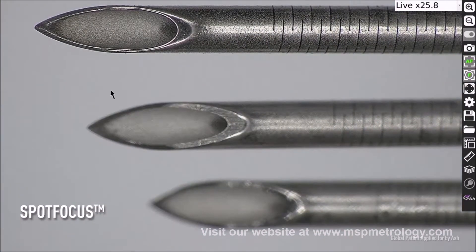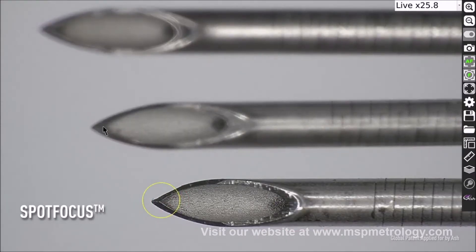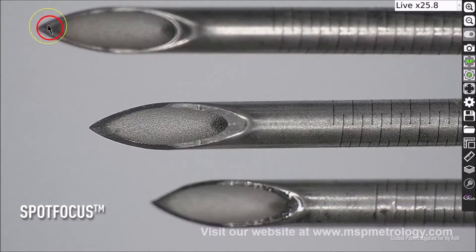Our new Spot Focus feature will rapidly focus on the part, improving focus accuracy, reducing human error and speeding up your inspection time.